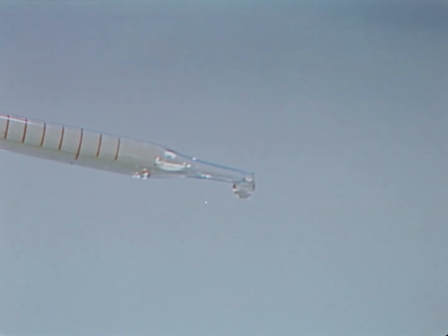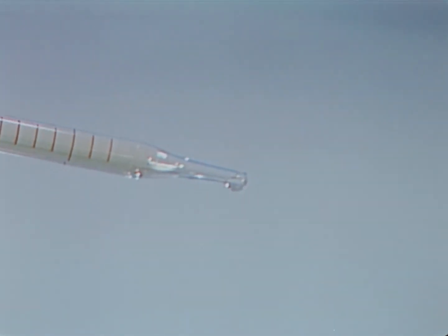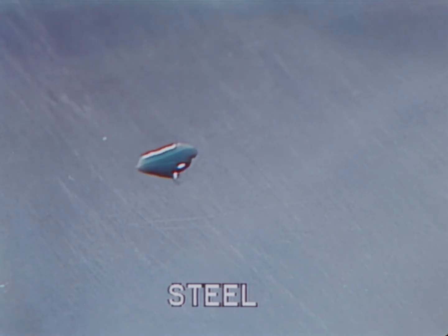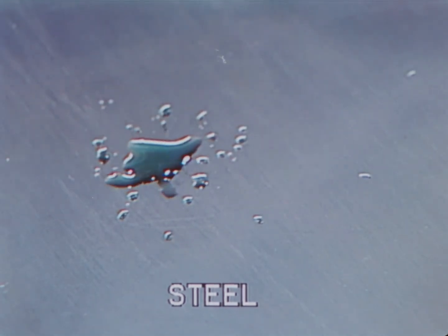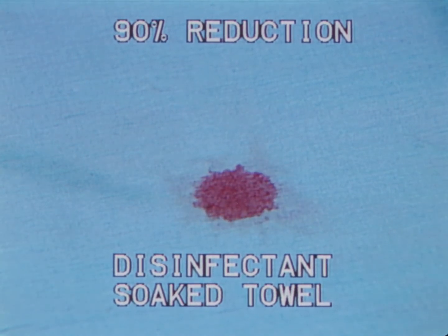Every microbiologist has, at some time, seen a drop of culture suspension fall from a pipette tip. The amount of potentially infectious aerosol thus formed varies with the type of work surface. The harder the surface, the greater the splatter. You can reduce such aerosols by as much as 90% by placing a towel soaked in disinfectant on the work surface.